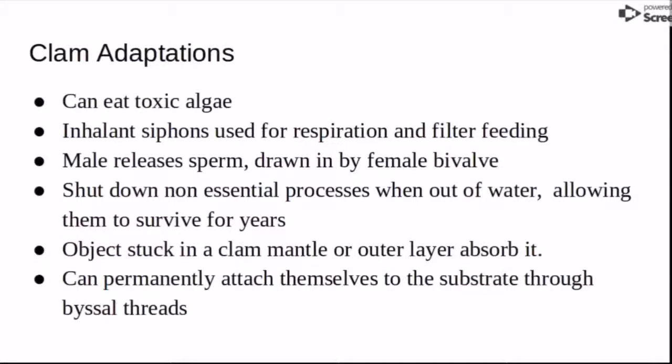Inhalant siphons are used for respiration and filter feeding. And another one is the male releases sperm drawn in by the female bivalve. And another one is they shut down non-essential processes when out of water, allowing them to survive for years. This means they can just stay out of water whenever they want due to this adaptation. And another one is an object.